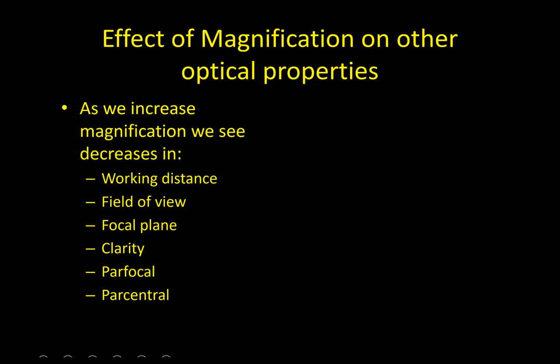So let's talk about the effect of magnification on other optical properties. Okay, so as we magnify, let's talk about working distance. So if this is the objective that I'm looking at my slide with, let's go with that. I'm going to draw this a little different. So here's my slide. This is my working distance.